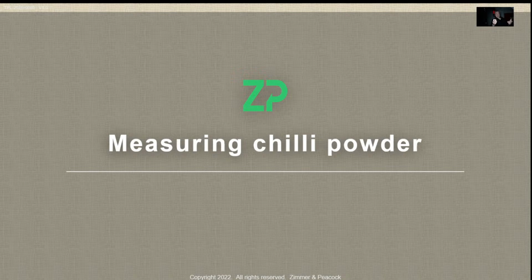the entire batch. So I think one of the big problems that happens is that people take a single sample and they send it for HPLC, high pressure liquid chromatography analysis, and they get a single result back with no error, and that's held as the sort of absolute truth. And I want to sort of pick that apart a little bit today.